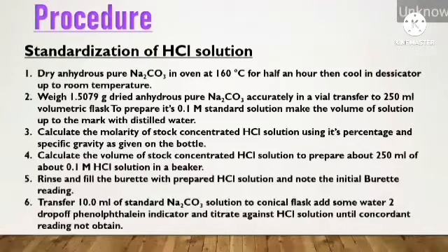Now the procedure: standardization of HCl solution. Dry anhydrous pure sodium carbonate in an oven at 160 centigrade for half an hour, then cool in a desiccator up to room temperature.